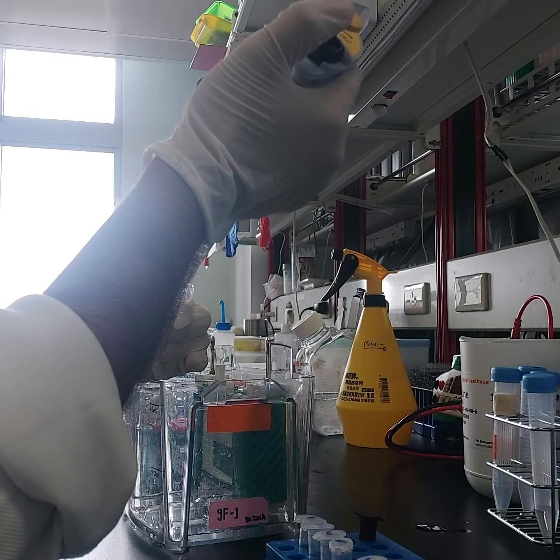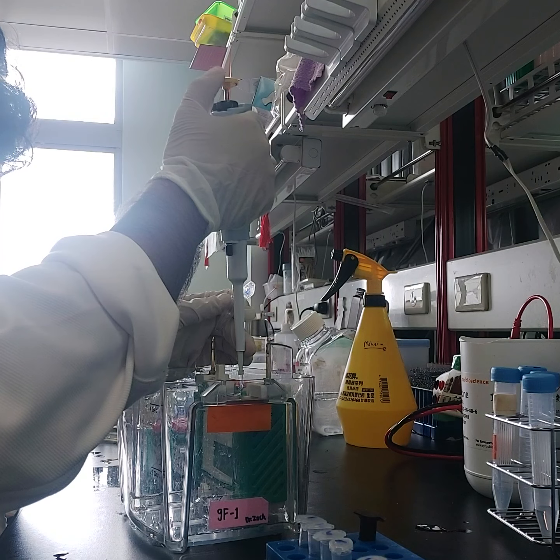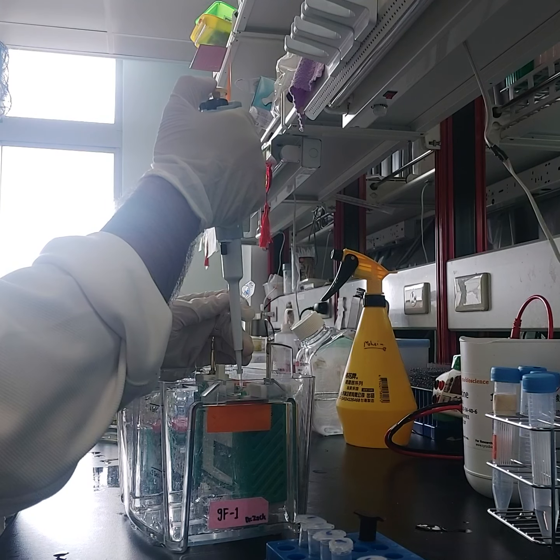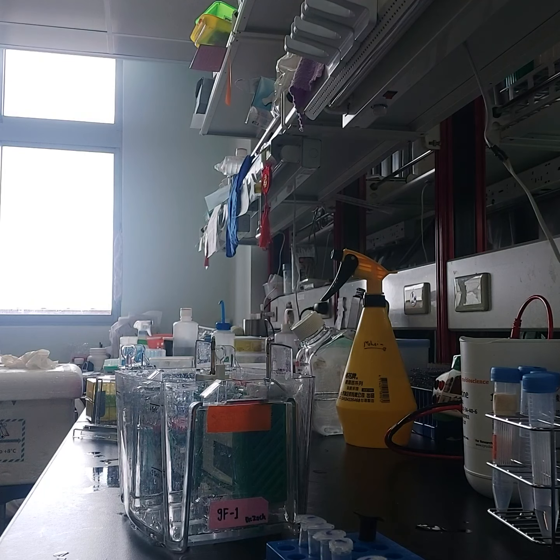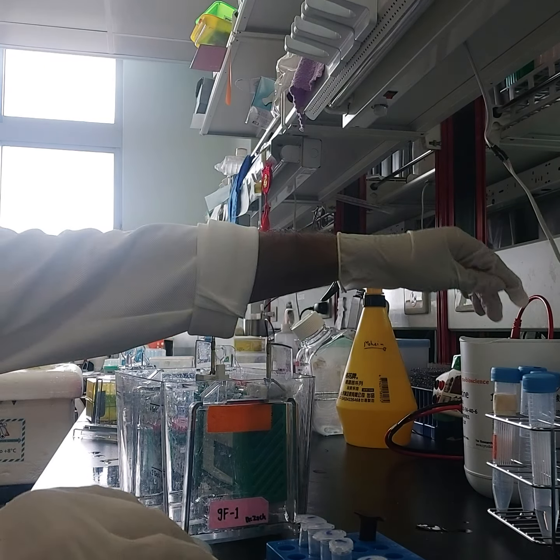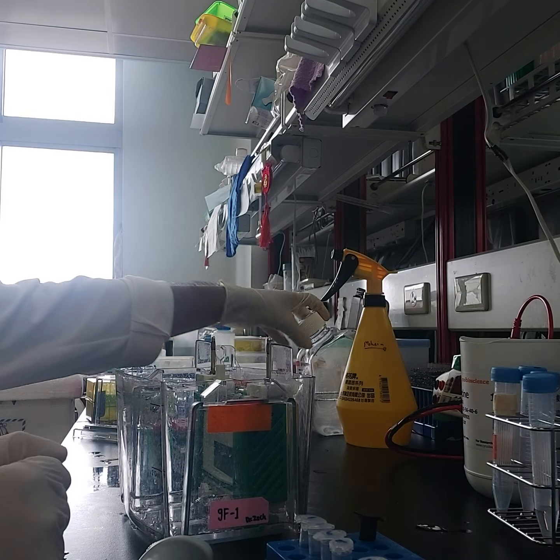Maybe because western blot has so many steps, so many questions arise when you do it. If everything is correct, you don't know whether the band will appear or not — sometimes it actually depends. Okay, my loading is finished.